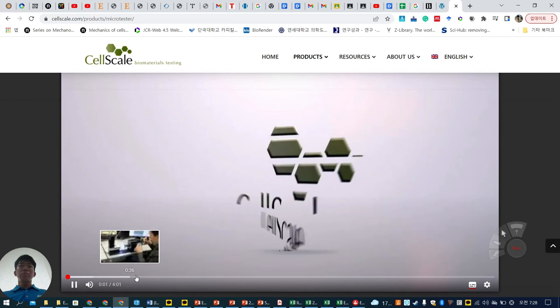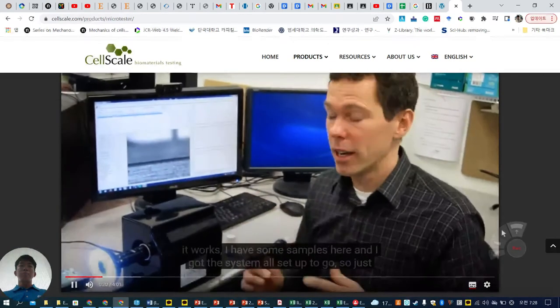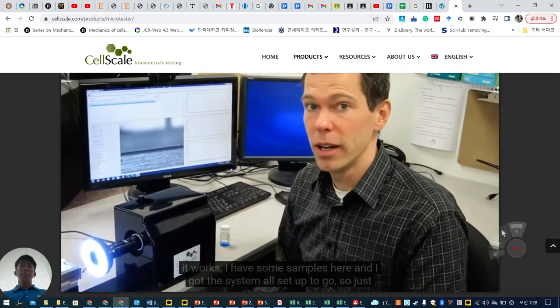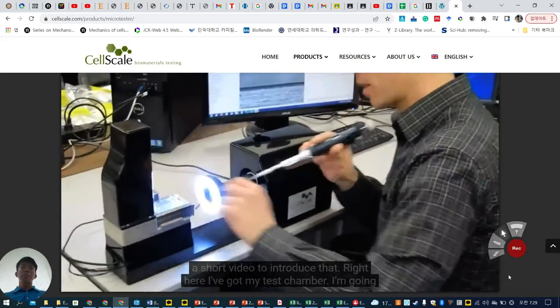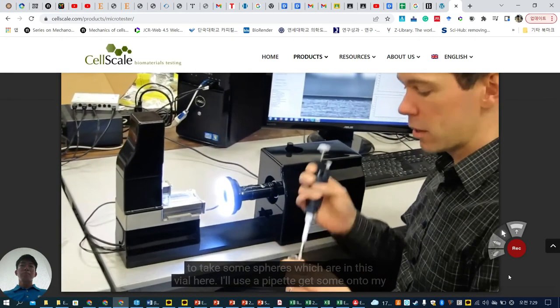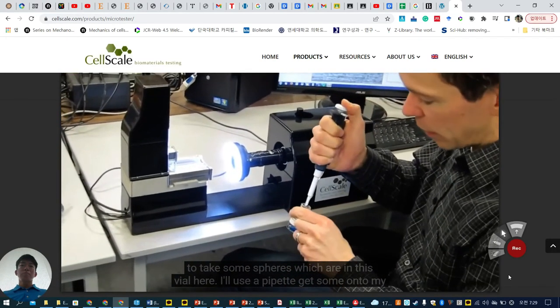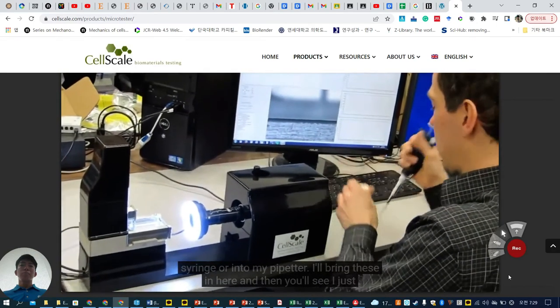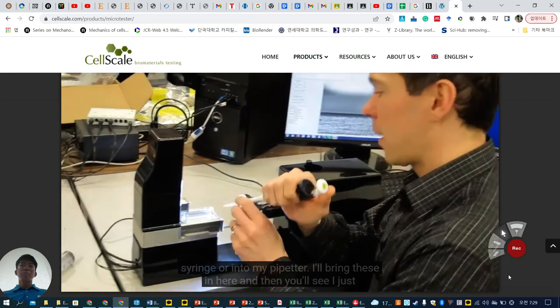System with some microspheres of hydrogels. So just to introduce you to how to use it and how it works, I have some samples here and I got the system all set up to go. So just a short video to introduce that. Right here I've got my test chamber and I'm going to take some spheres which are in this vial here, use a pipette, get some on my syringe or in my pipetter, and I'll bring these in here.